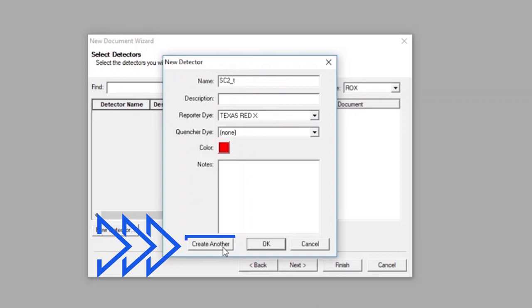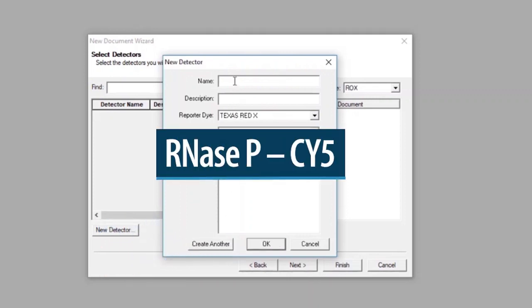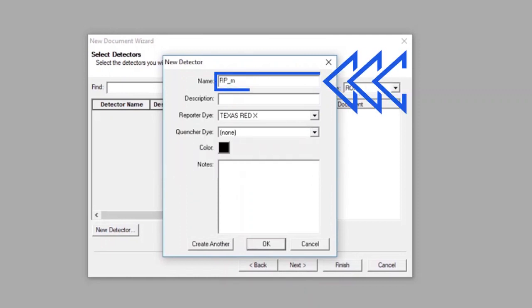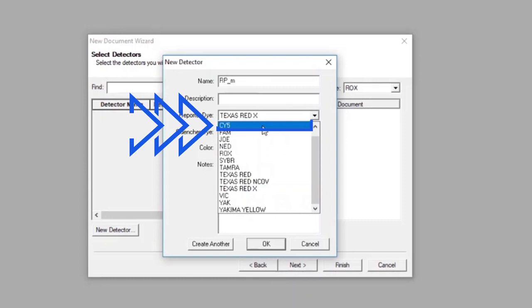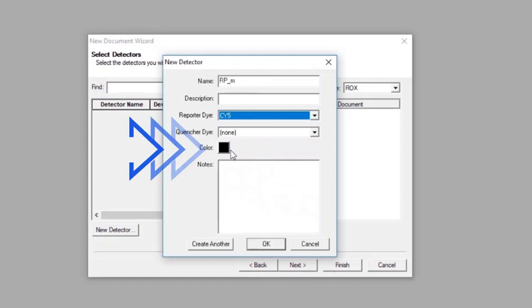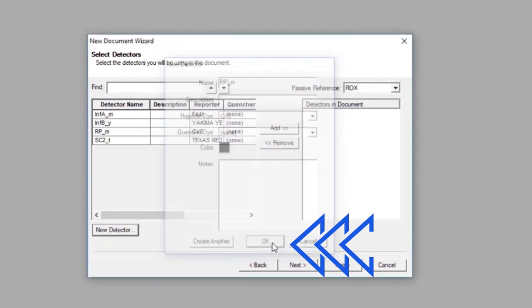Select Create Another once more. To create the RNase P CY5 detector, type RP_M into the Name box. Leave the Description box blank, and set the Reporter dye to CY5, but leave the Quencher dye set to None. Select black as the color of the RP_M detector. Click OK on the New Detector screen.